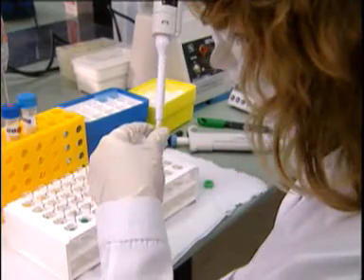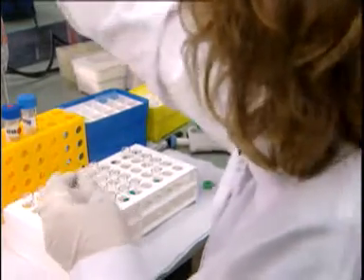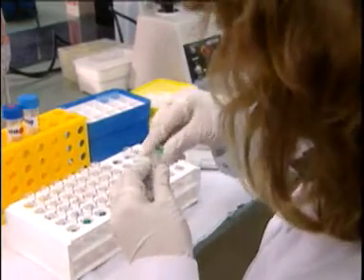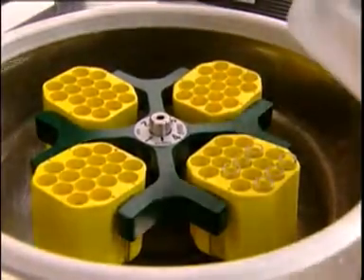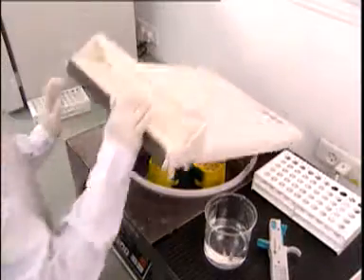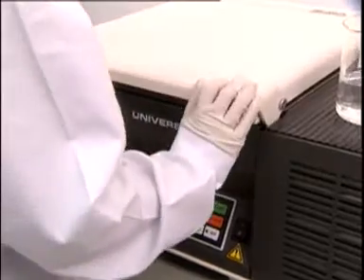The tubes are then incubated for 30 minutes at room temperature, and washing buffer is added to all except tube G. After centrifugation, the pellet in each tube is resuspended with buffer and is ready to be read by the flow cytometer.